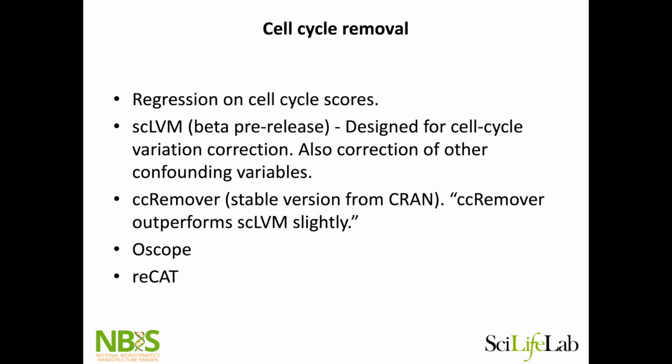I think for me, these give fairly similar results still, and it's not always the case that you manage to remove the cell cycle effect even though you do this. That could be an effect of the scores not being calculated correctly, or that there are additional signals in the data that are so strong that you can't remove the cell cycle effect. I found, especially working with cancer data, it's almost impossible to remove the cell cycle effect in a cancer data set completely.